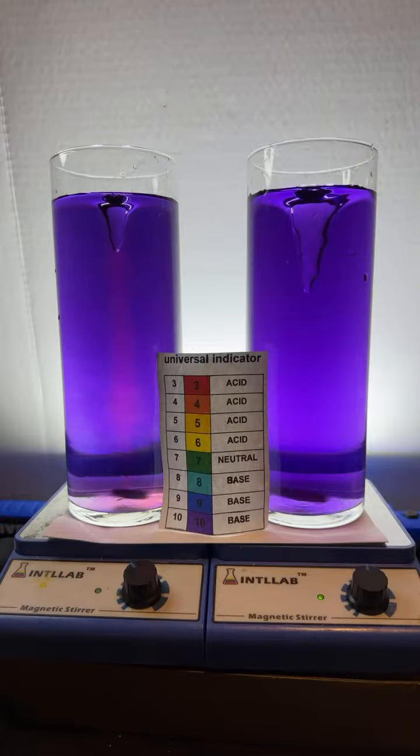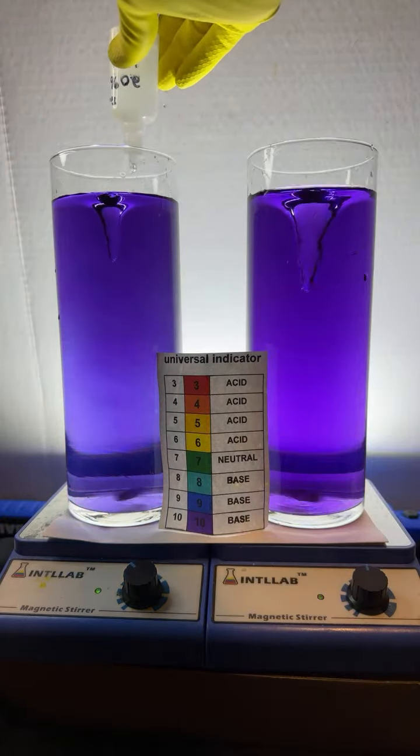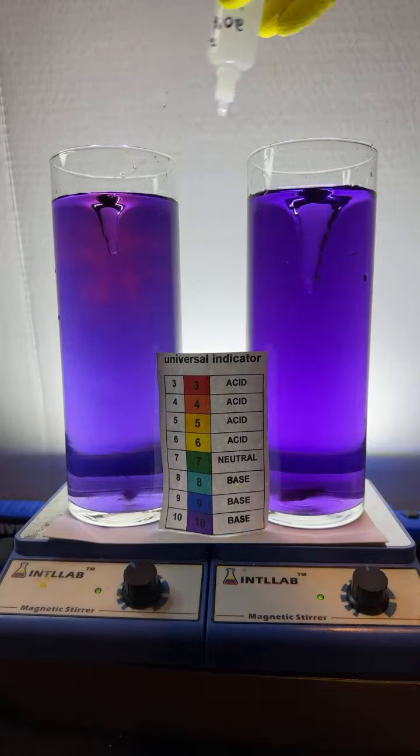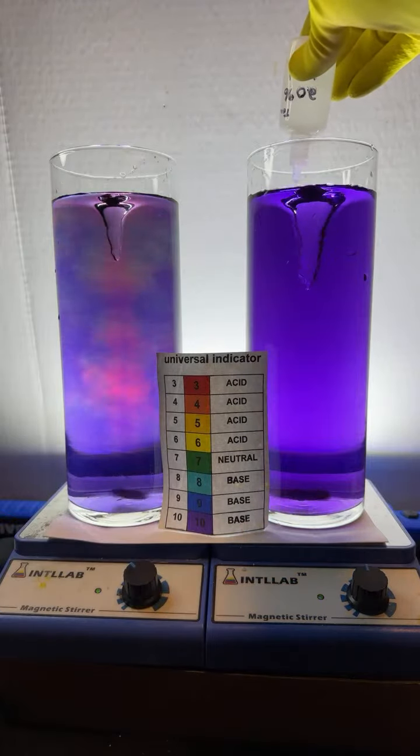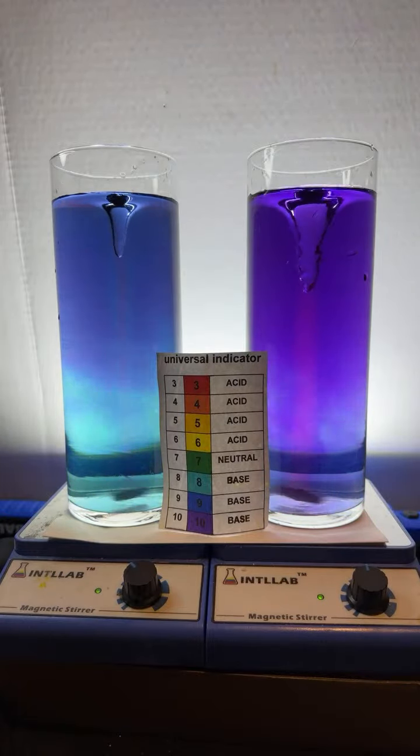Thank you there, Zachariah. Look, we got a little rainbow action going on. That happens sometimes. Let's add another little drop over here on the left. I'm going to add a drop over here on the right too of hydrochloric acid. Look at that gorgeous color over there on the left. The right's looking pretty too.